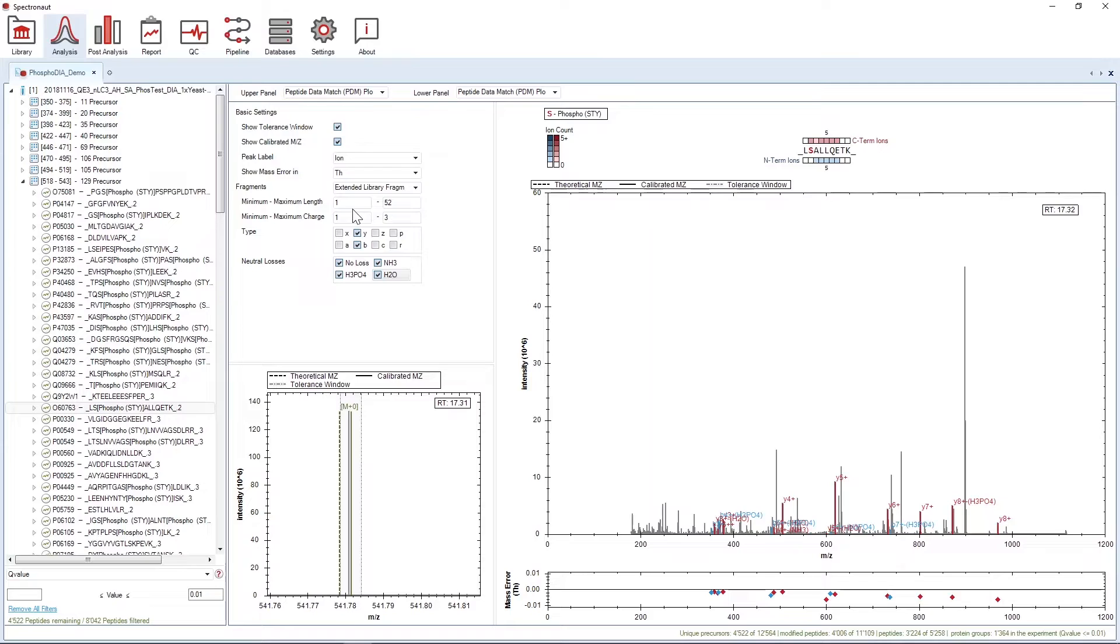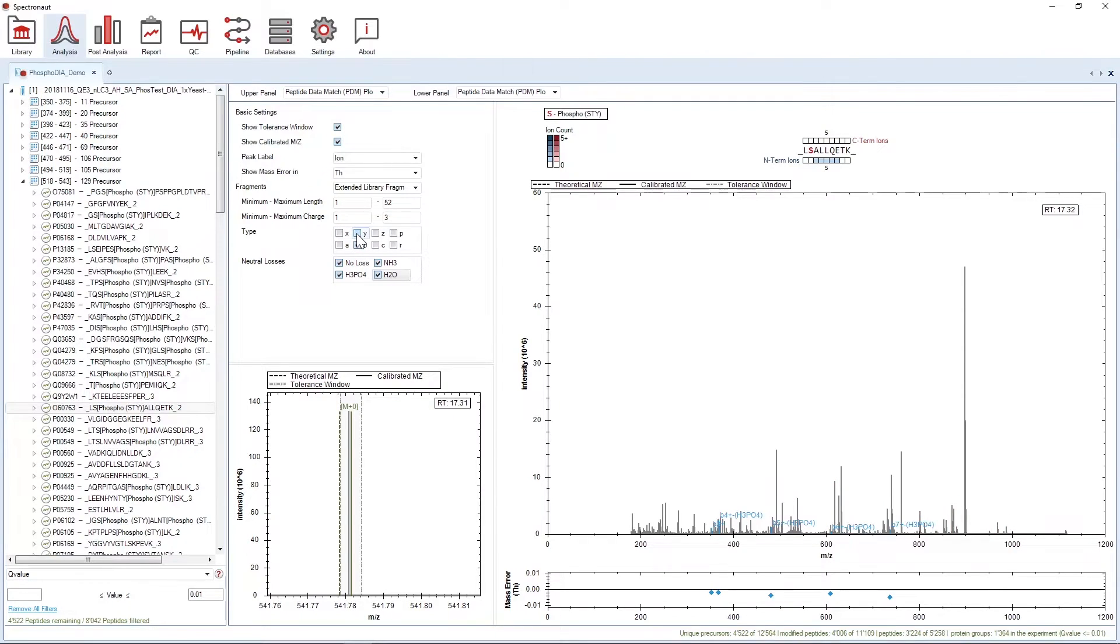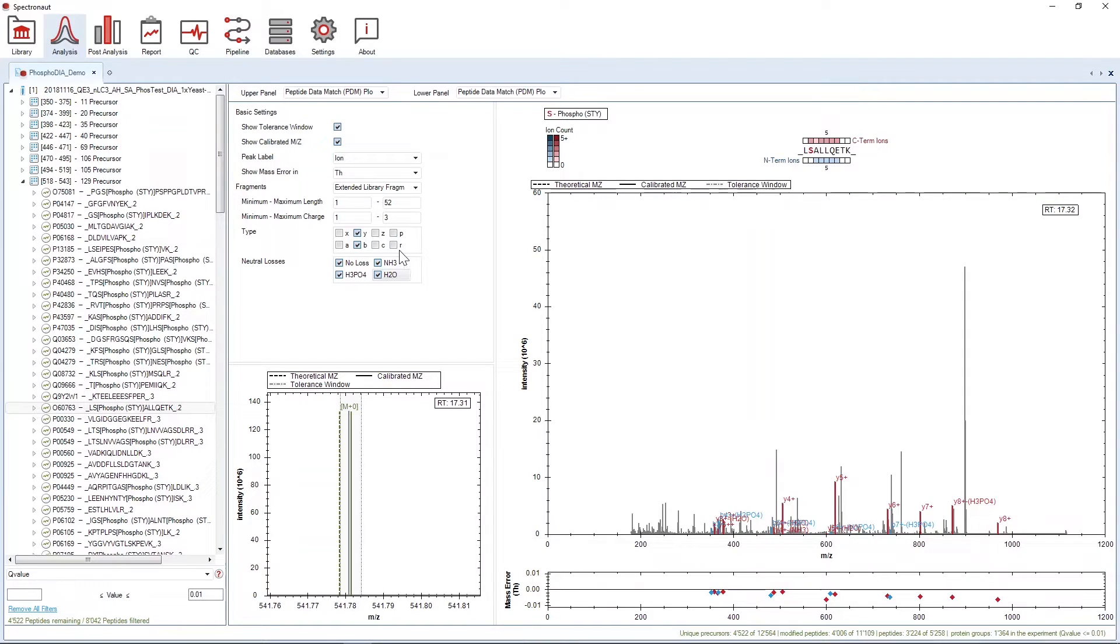You can also adjust the minimum and maximum fragment position and charge to be visualized, as well as the ion type, where P stands for precursor and R for reporter ion in isobaric labeling experiments.